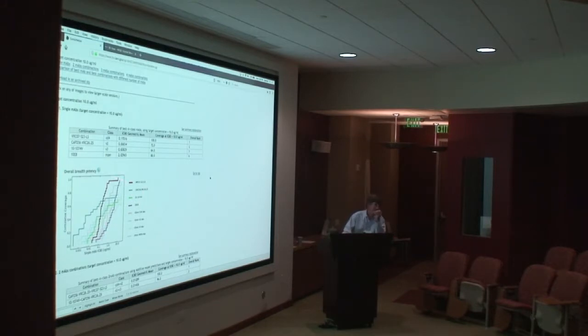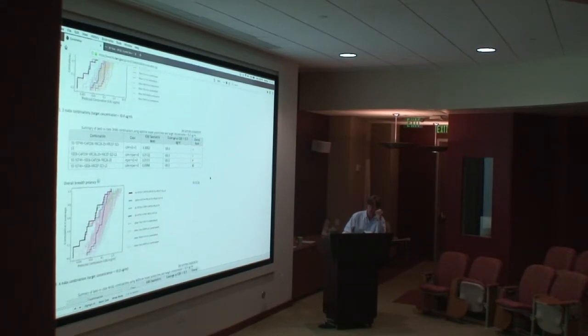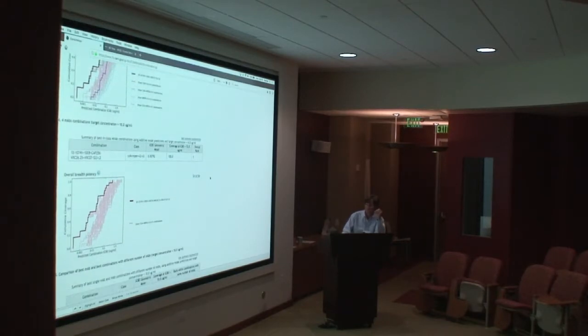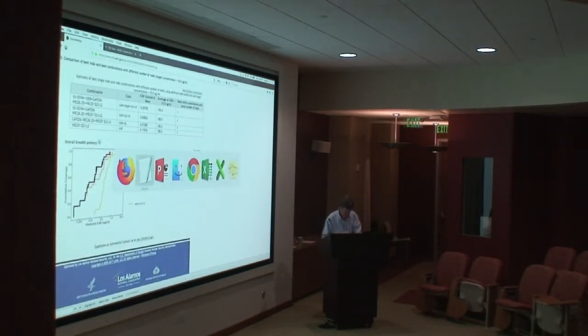Okay, so this is in fact giving us a list of, these are the same figures I think we showed you before. So the single antibodies and the combinations of 2, combinations of 3, and combinations of 4. So that's what you get if you do it with your own data. If you gave it only 3 antibodies, you would only get combinations of 3, because we can only do what we can do. We're limited by the realm of possibility.